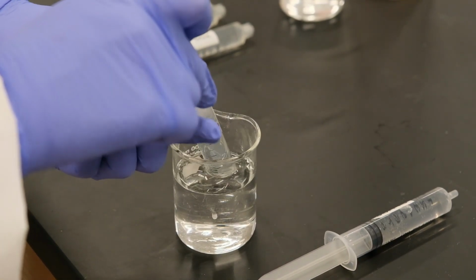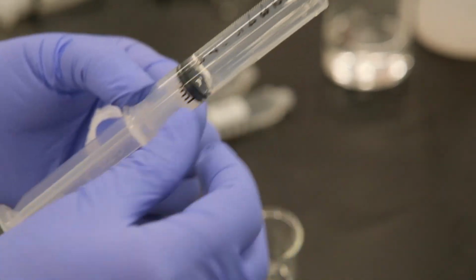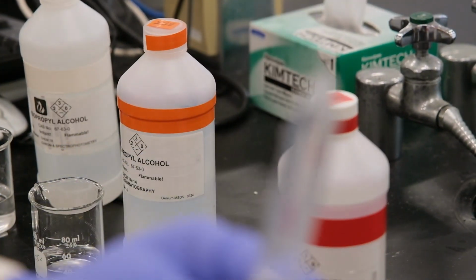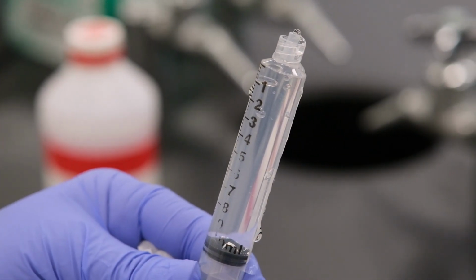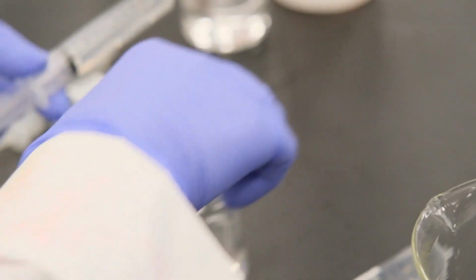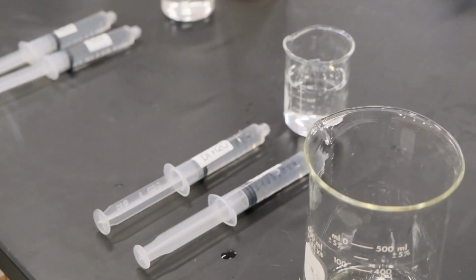So we go above 10 milliliters. We have a waste here. We look at the mark of 10 milliliters, so I'm not up there yet. We look at the mark, and we flick the syringe so that there are no bubbles, and then we go up to the 10 milliliters. So this is for the deionized water, and these are for the other solution. Same thing with the Kool-Aid.